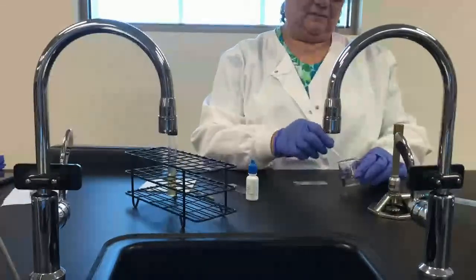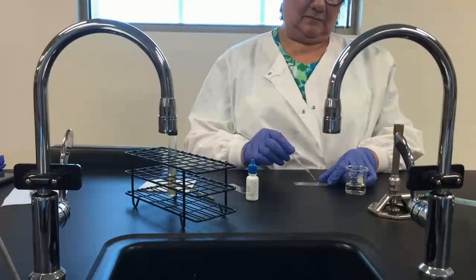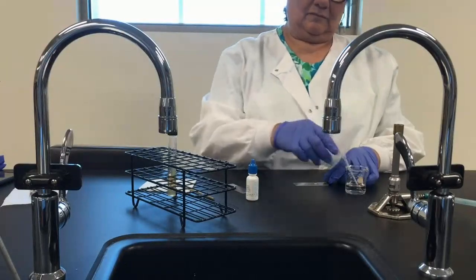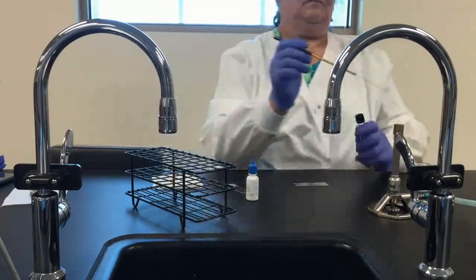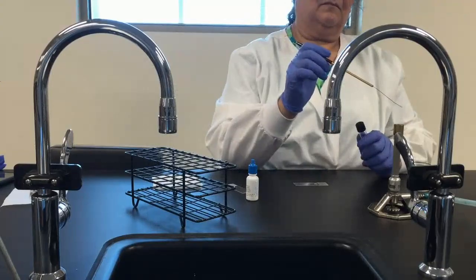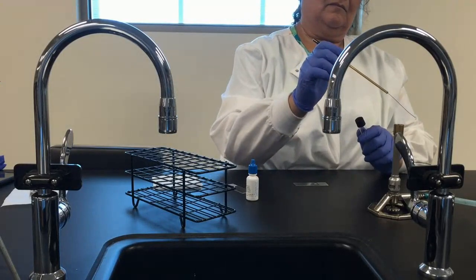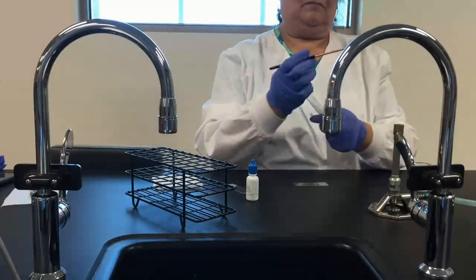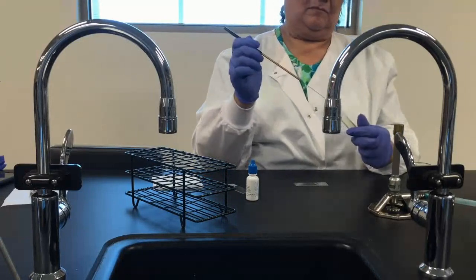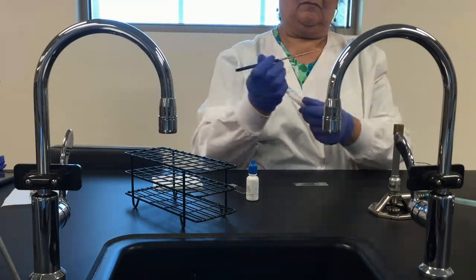We're going to start with a nicely scrubbed down microscope slide. Use a pipette to put a couple of drops of water at one end of the slide. Then we will aseptically remove a little bit of the organism from the slant that Renee prepared, and that organism will get mixed into the drop of water. Now, we're not going to spread it out at this point. We're just going to mix the organism into the drop of water.